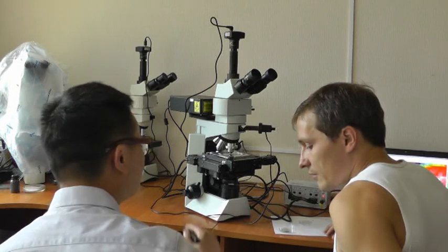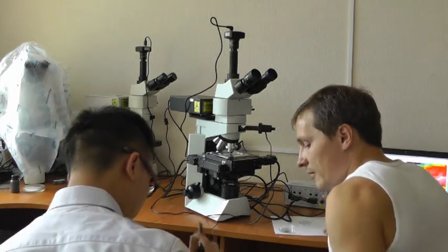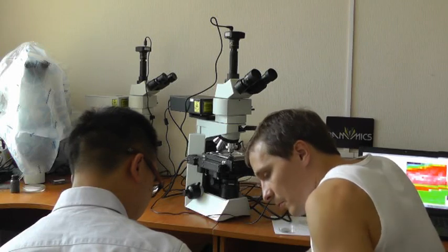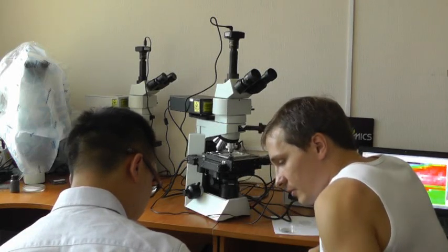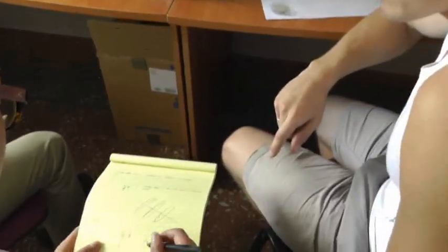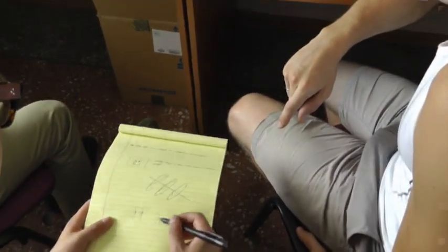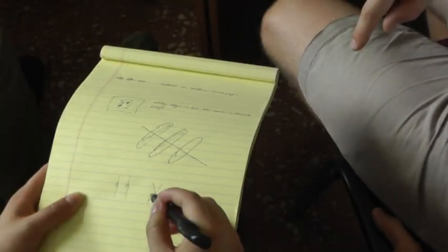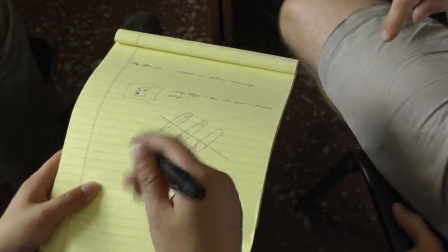I have never seen microscopes with intersecting optical branches. What does it mean? There are some microscopes with this kind of system, which in this part is not parallel. It's not in parallel beams.